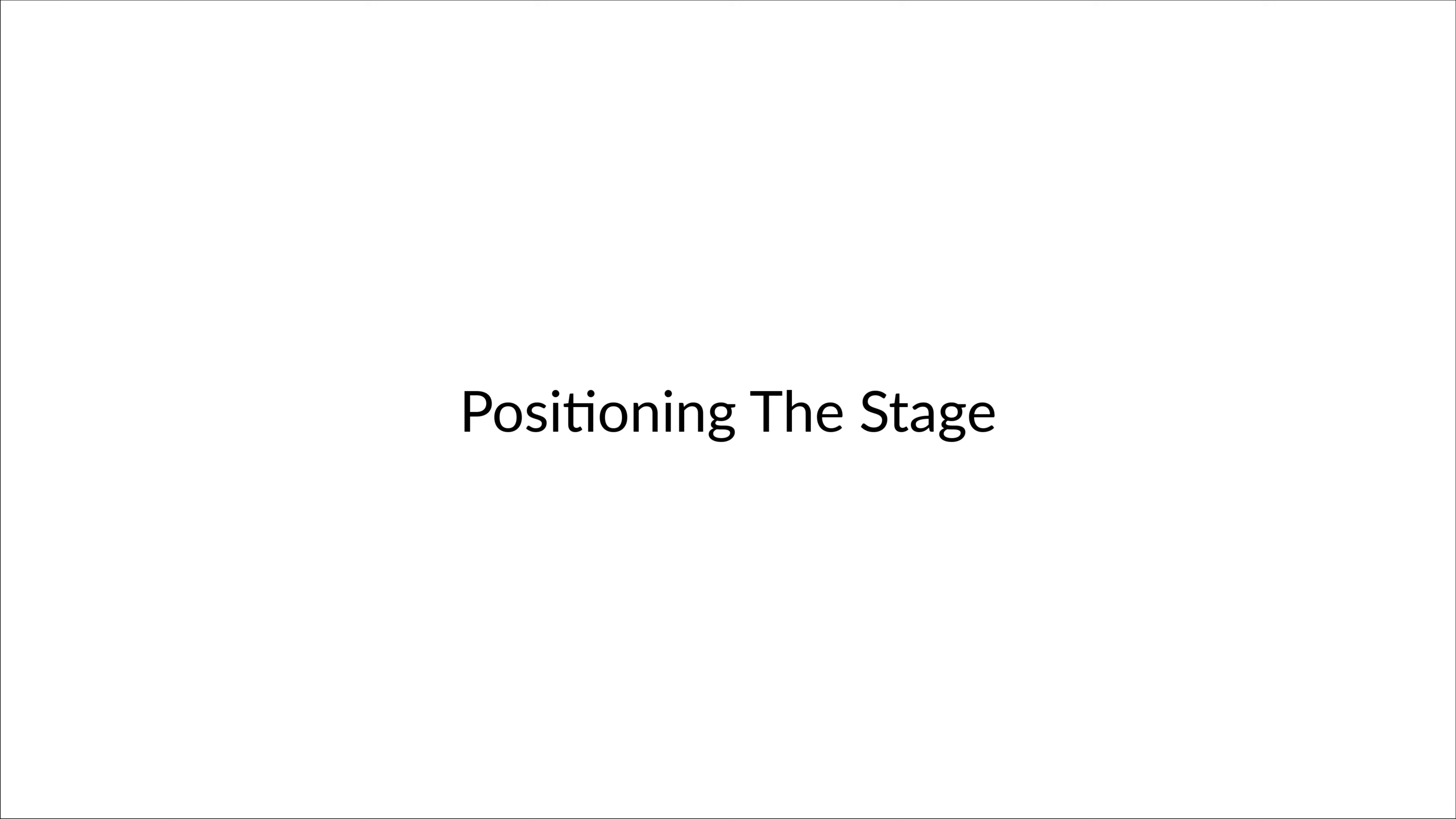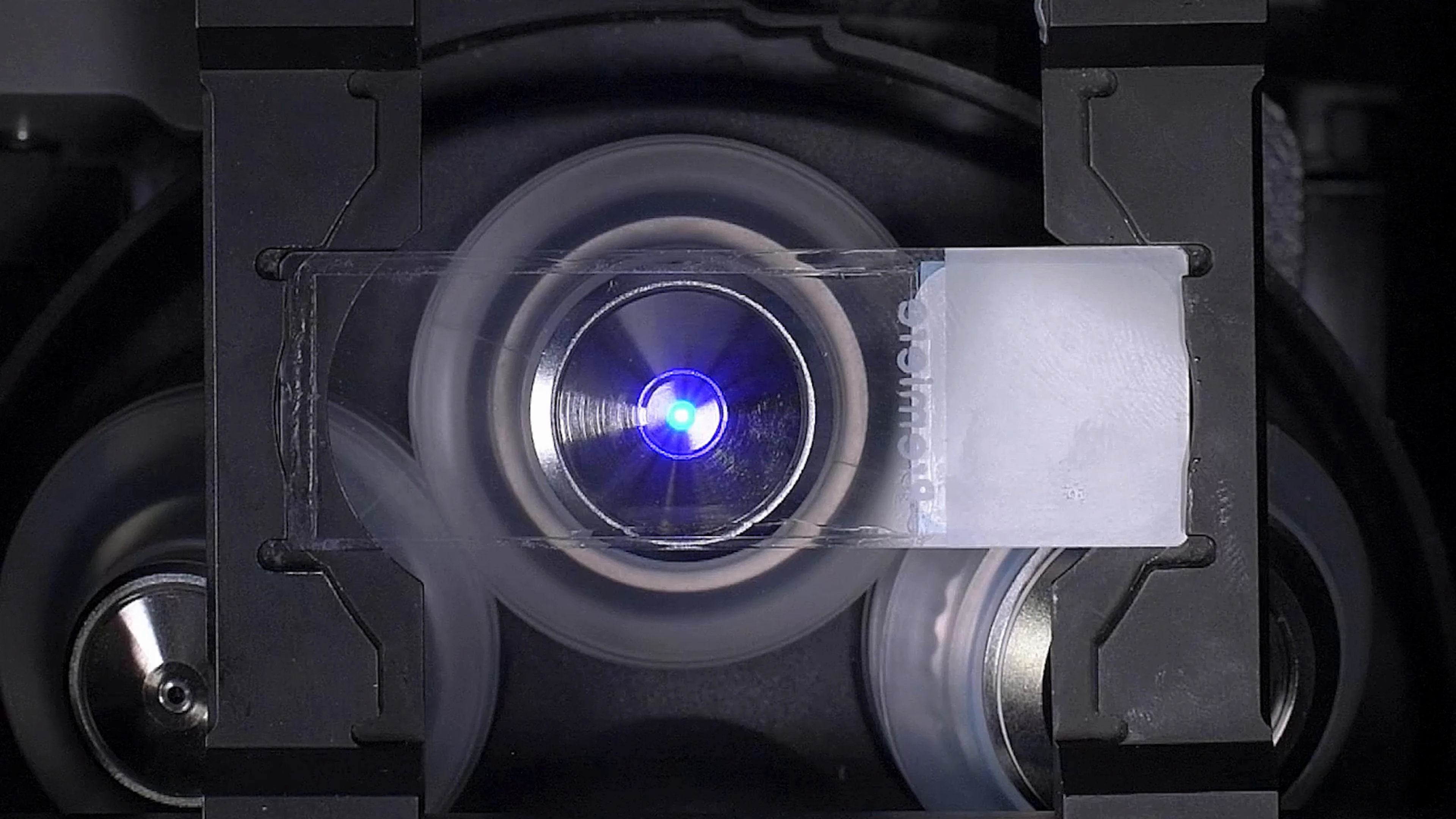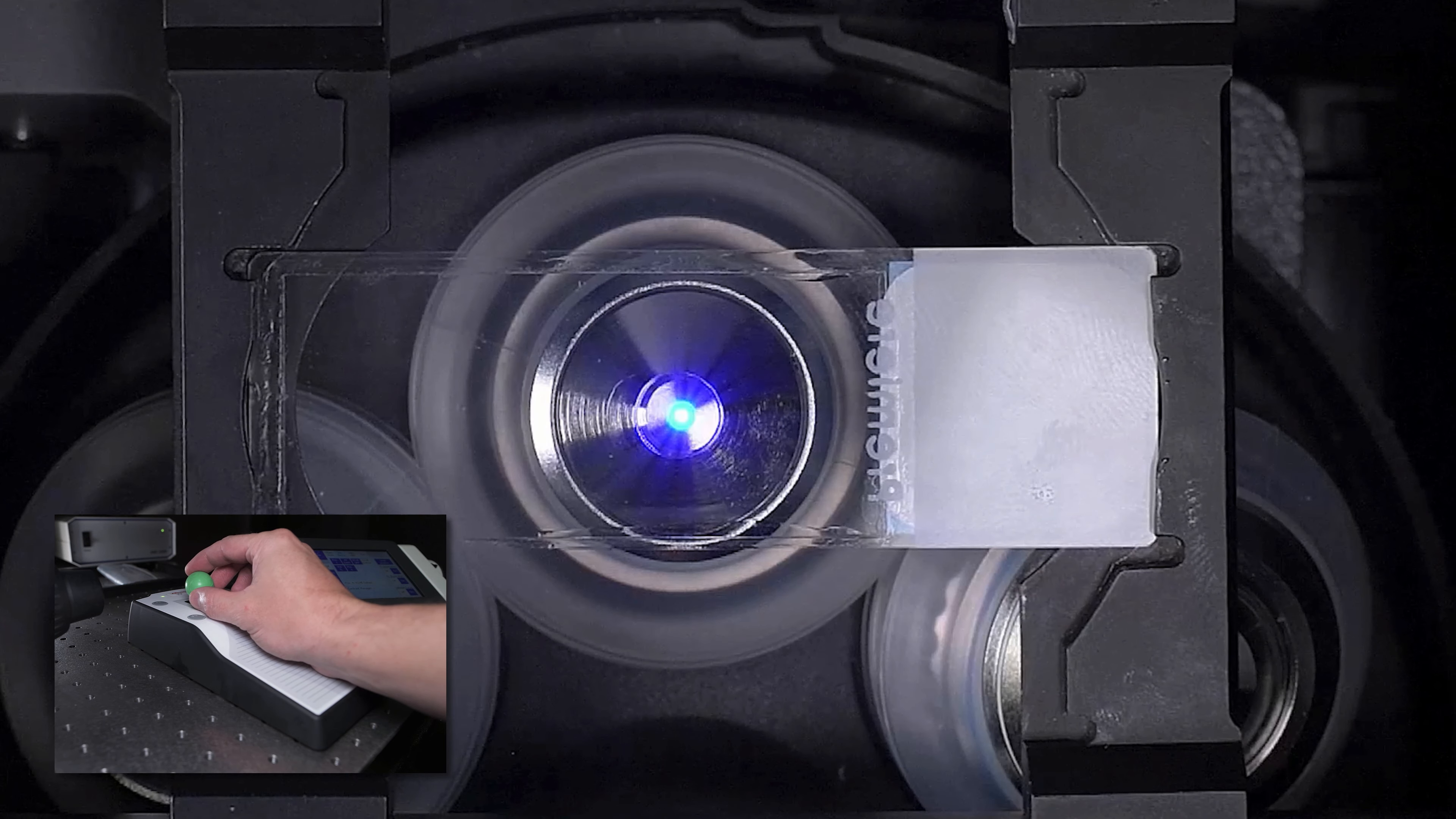Once we have our specimen mounted and focused correctly, we can use our motorized stage to move to different areas on the slide as necessary. High NA immersion objectives often come with very small working distances, on the order of a few hundred microns or less. So we need to be very careful about how far and how fast we move our stage.